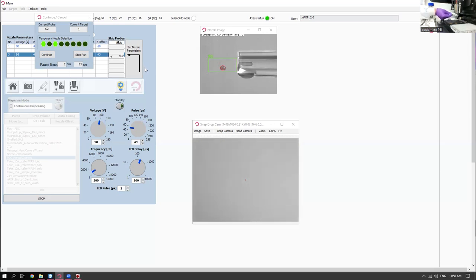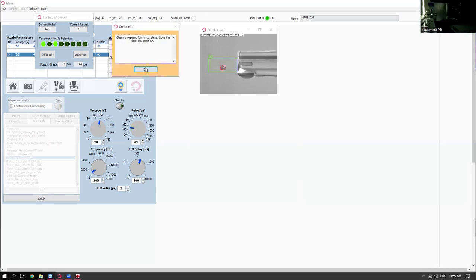If you're going to do this on an uncoated glass nozzle, it will become extremely hard to fill it when you get it super clean. That would be a problem, but because these are coated nozzles, essentially what you end up exposing is that coating again. It has that well-characterized hydrophobicity.